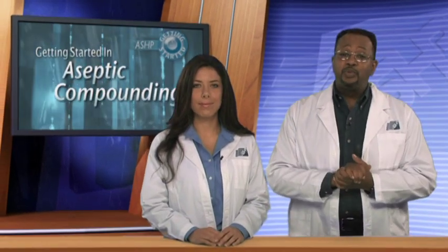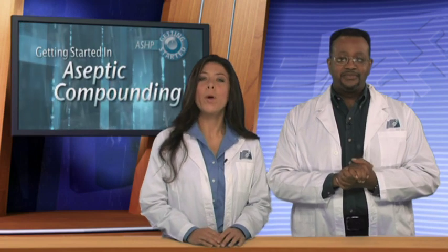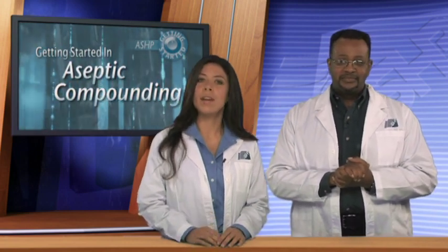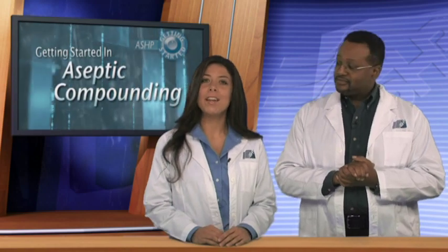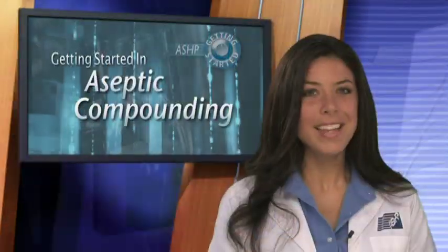Today we're going to explore the basics of aseptic compounding. In this program, we'll demonstrate the importance of aseptic compounding, take a look at its fundamental techniques, and describe and explain the equipment most often used. As you'll soon see, aseptic compounding can be an interesting, challenging, and important part of your job. So let's get started. First of all, what is aseptic compounding, and where and when is it required?